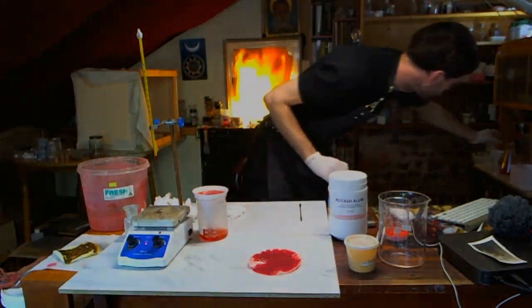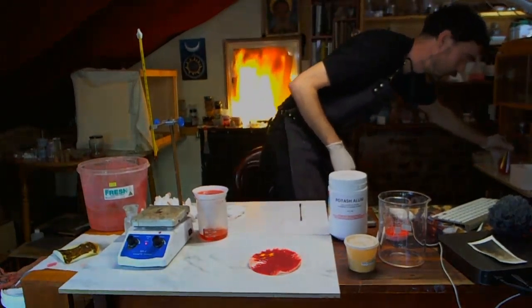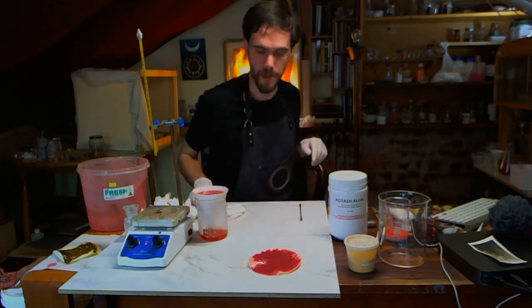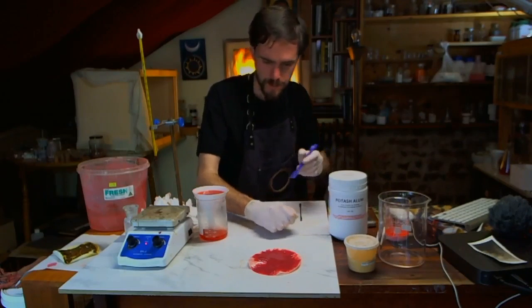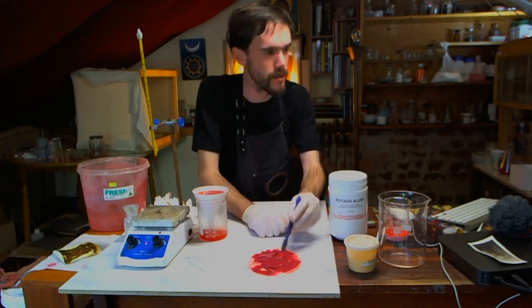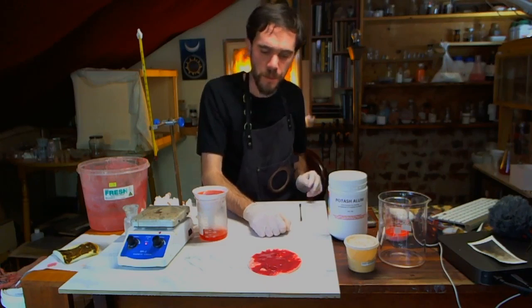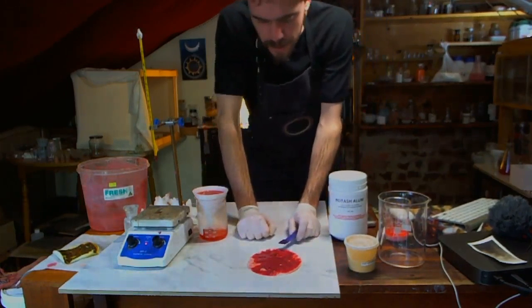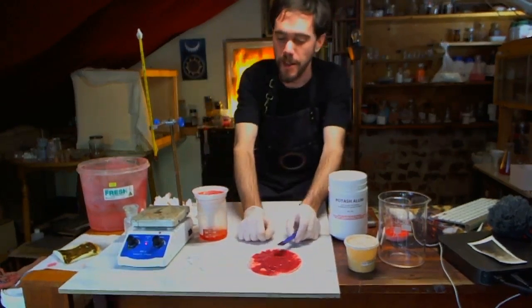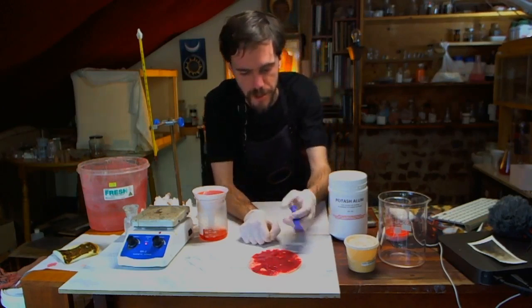So that's what we got out of when we were filtering here. So this is the precipitate from the hydrochloric acid wash. This is interesting. It's a little bit more purple than I'm used to. I'm not really sure what to make of this at the moment.